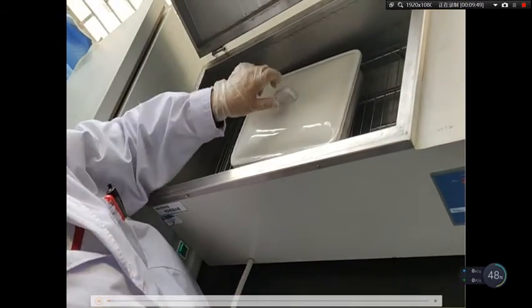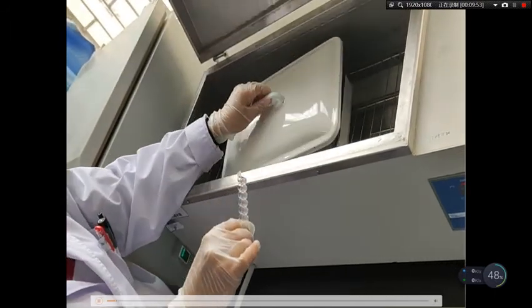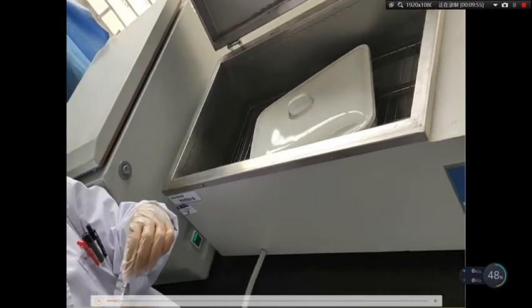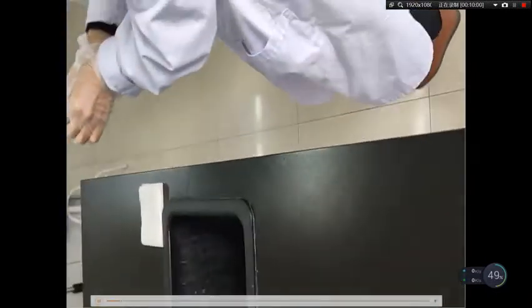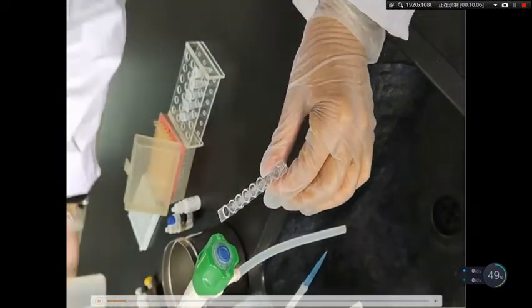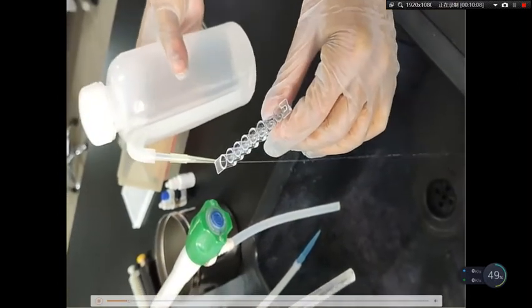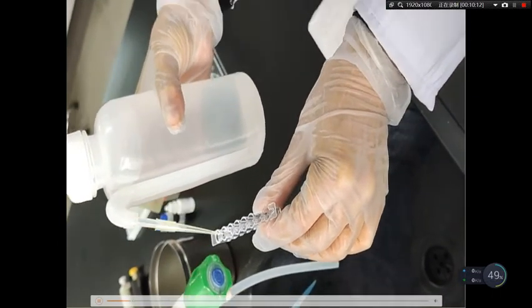After 30 minutes, we take out the plate, and next we need to wash the plate. First, we discard the liquid and add wash buffer to the plate, not too much, avoiding overflow.